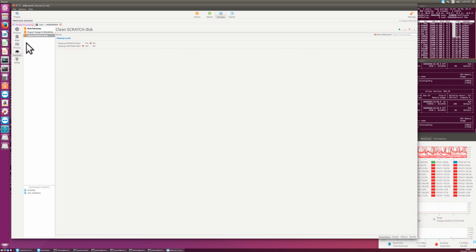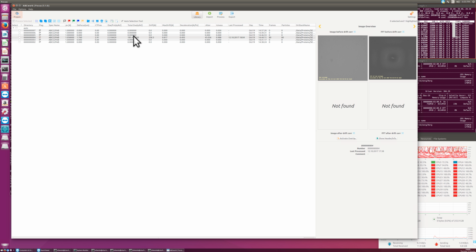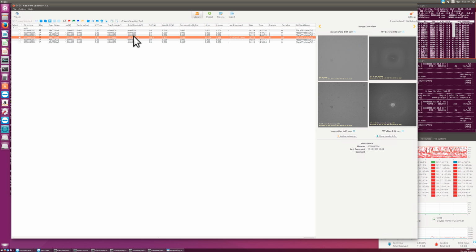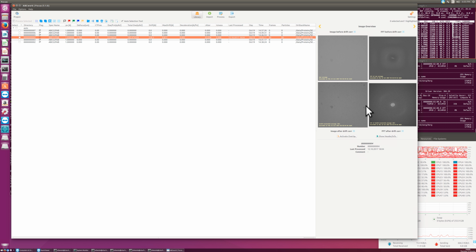The others I don't use at the moment. So this would be all we want to do, and I close this image here again. This would be all we want to do. This were all these scripts here. And then now we have these determined, and they are displayed very fast because what we're looking at here is a small PNG file that is made by the scripts from the large images. So you can later scroll up and down here very quickly, and these PNG files are displayed quickly.